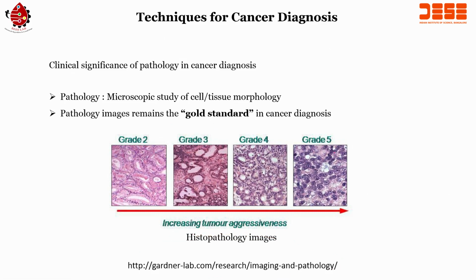Here you can see there are many cells with different morphology, abnormal growth, right, and based on this gold standard the diagnosis will be done as to which grade the tumor is within.